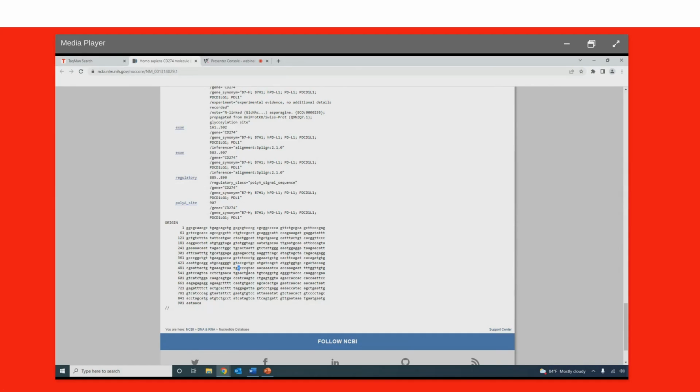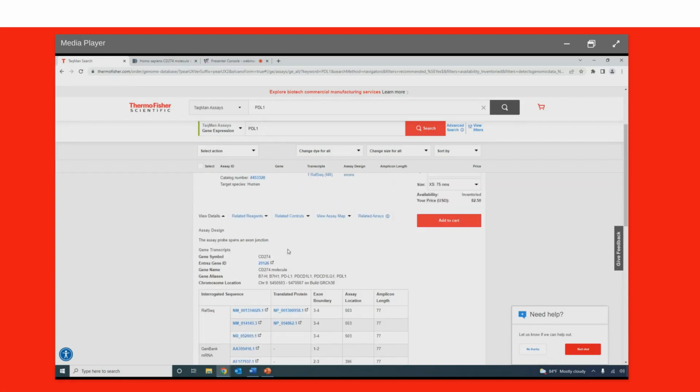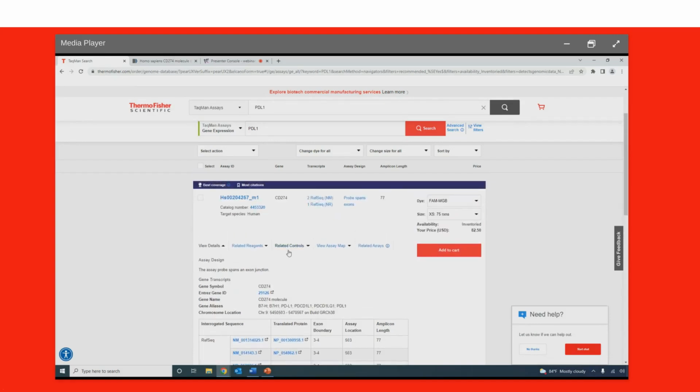So that padded amplicon sequence will contain the annealing point of your primers and probe. It'll contain your true amplicon sequence generated by this assay, but you will not get the exact primer and probe sequences. And so all of that information can be obtained just publicly from these TaqMan assays without the primer and probe sequences being given to a customer that were to purchase this assay.